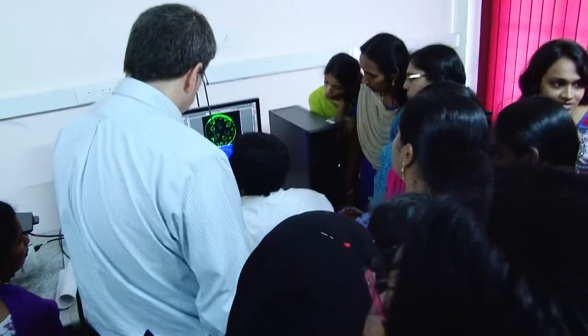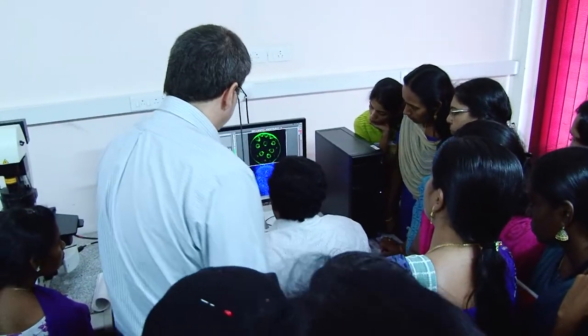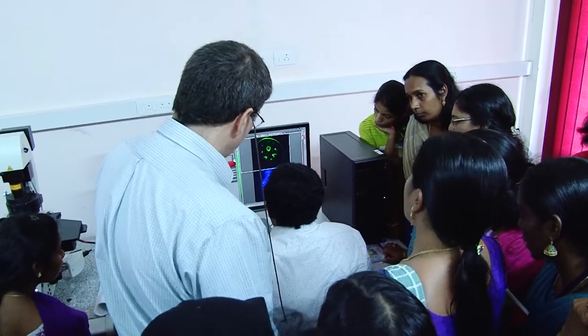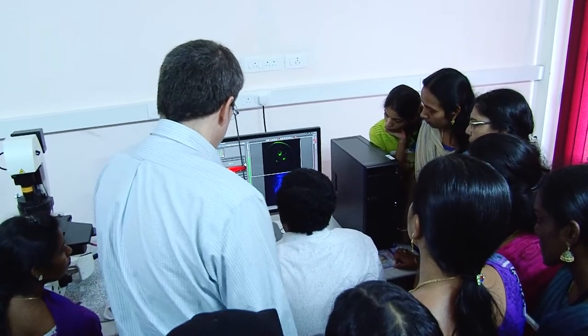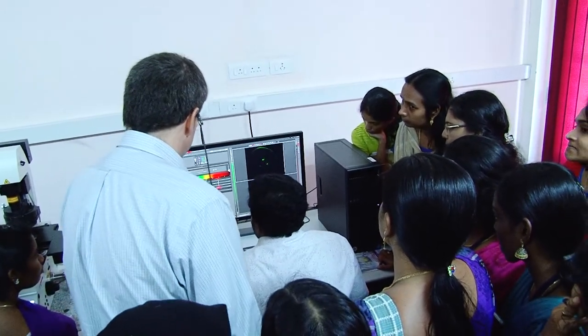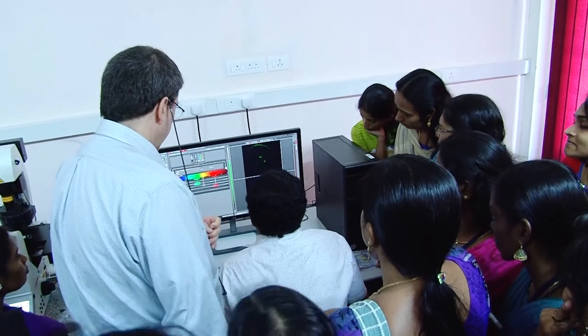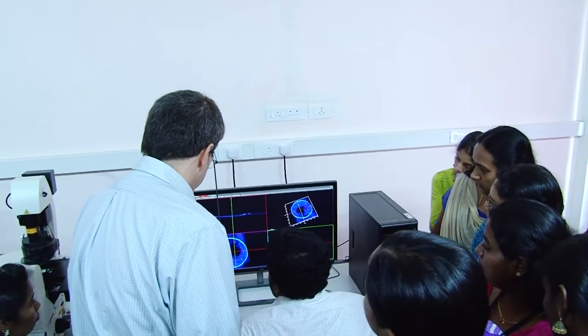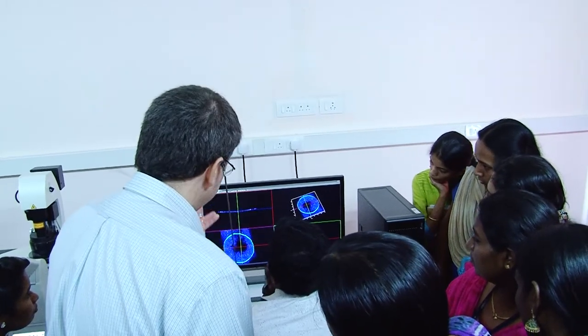Okay, this is convallaria. It's a plant. It actually grows in my yard. I don't know if it grows here. I think it's a cold weather one. But at home, we call it Lily of the Valley. It's a real pretty little flower, like right now it's dormant in my house because it's cold. But supposedly when spring comes, it's one of the first flowers to bloom. Why we use it all the time in this, I have no idea.